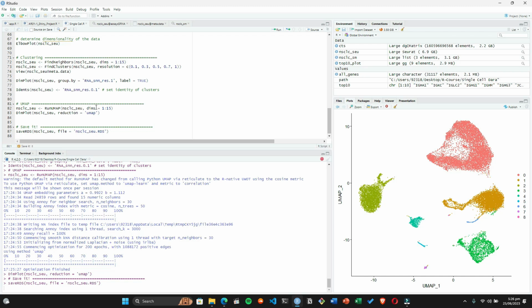So now we can view the data. So here you are seeing that we have the original identity, count data, feature data, percentage, and 1, 2, 3, 4, 5, 6, so many runs we have. So let's plot another one, and here we can see our sequencing PCA data. So let's zoom into this analysis, and here we can see the number of our genes, PCA, and things like this. And now we move to our identities, and then we can plot the UMAP as well.